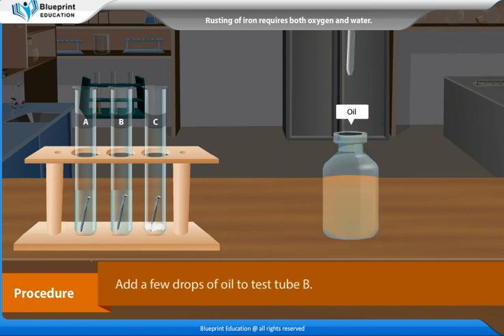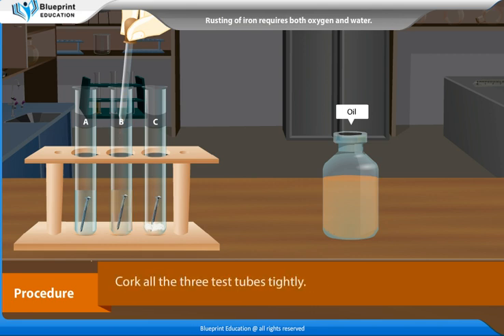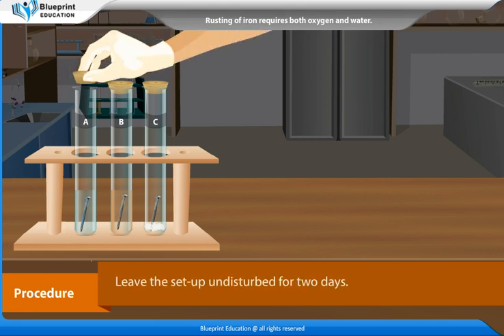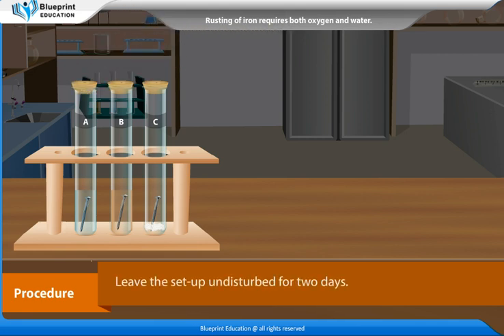Add a few drops of oil to test tube B. Cork all 3 test tubes tightly. Leave the setup undisturbed for 2 days.